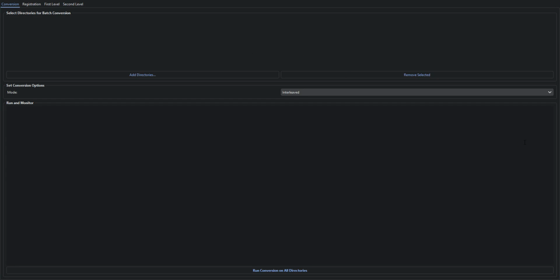Okay, hello. So this is the Phasor Handler version 2.3. Today I'll be showing a bit about how you can use this tool for your everyday analysis. It's going to be a really quick tutorial video.